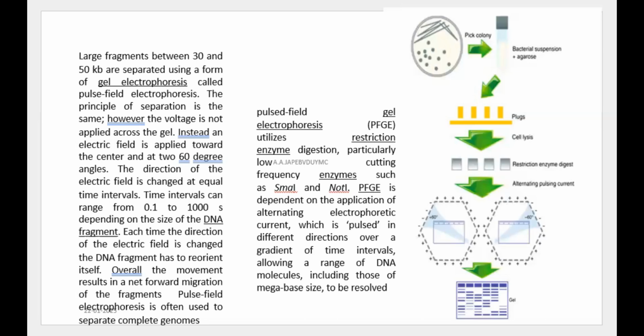Girls here are there. But okay, now you are starting with the next technique, that is pulse field gel electrophoresis. Earlier I discussed capillary electrophoresis. When I say pulse field gel electrophoresis, we have seen in the previous lecture about the agar gel method for DNA separation, fractionation. So DNA of about 60 kilobase or less, you are analyzing with native gel electrophoresis.